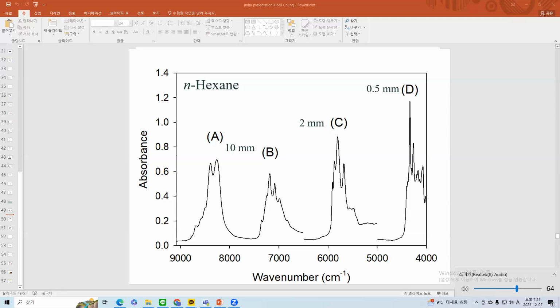I have a question about the modeling techniques currently being used in NIR calibration. Professor Chung has rightly pointed out the integrity of the signals and what parameters we should consider, and those are very insightful observations that we need to look into. But right now, are there any other good multivariate techniques available in the recent state of the art other than PCA or PLS?